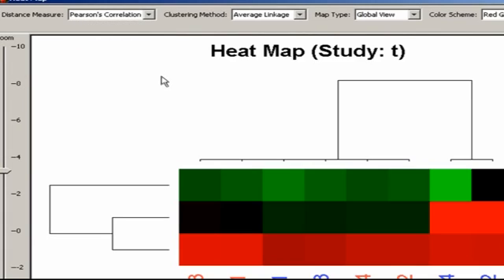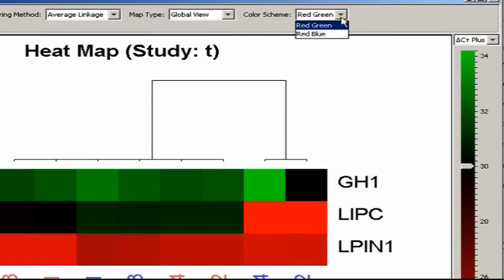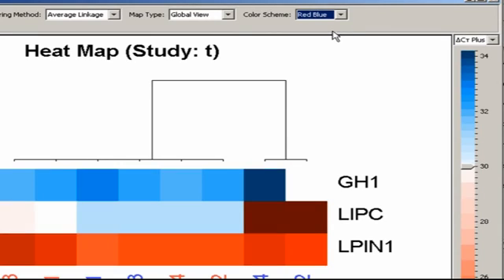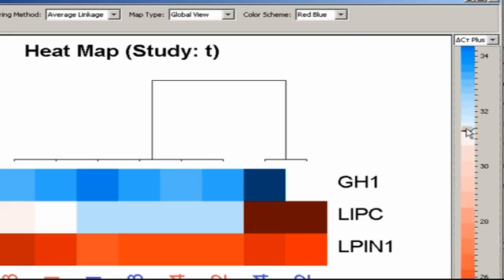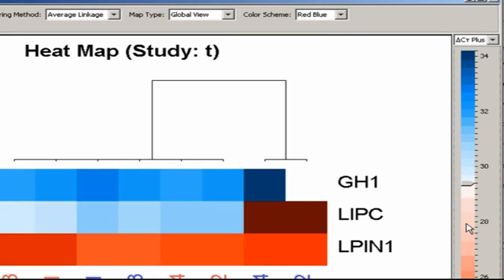Distances are calculated for delta CTs using either Pearson's distance or Euclidean distance. The various red and green colors represent up and down regulation, respectively, although you can also switch to a red-blue color scheme. And you can adjust which colors correlate to a particular delta CT.